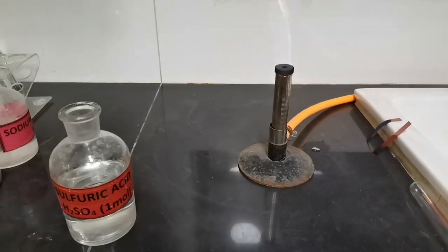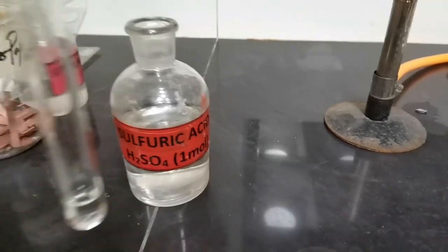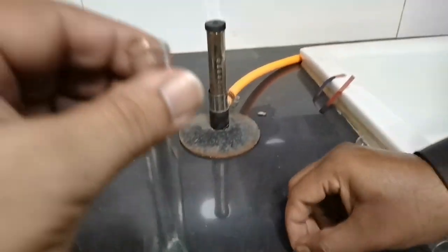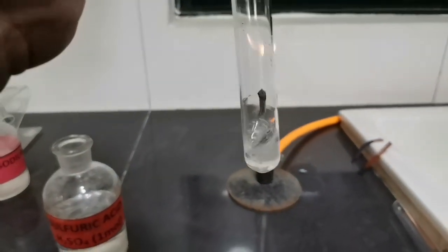Hi guys, we will be testing for hydrogen gas in this video. I have poured some sulfuric acid into this test tube, to which I will be adding magnesium ribbon.